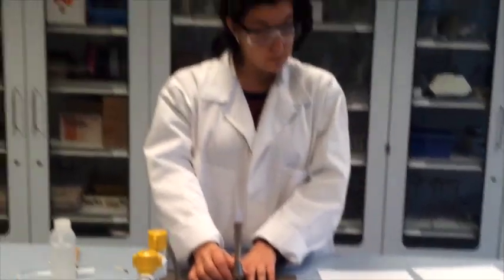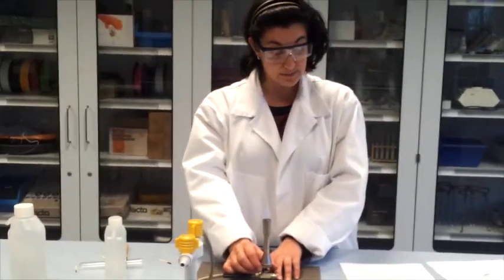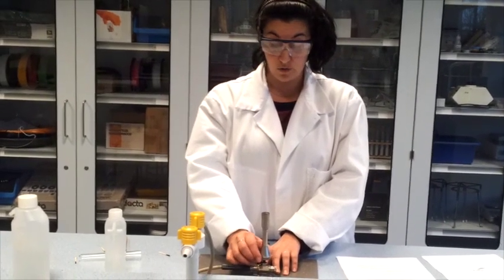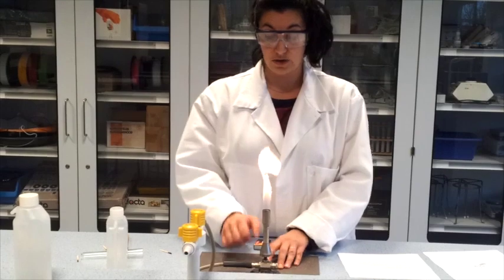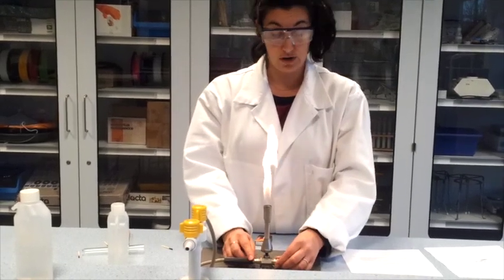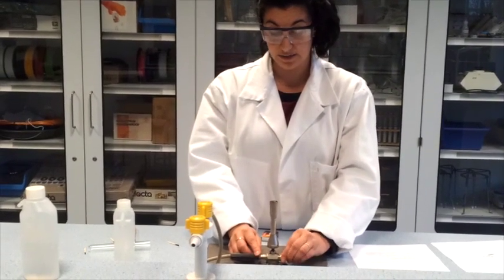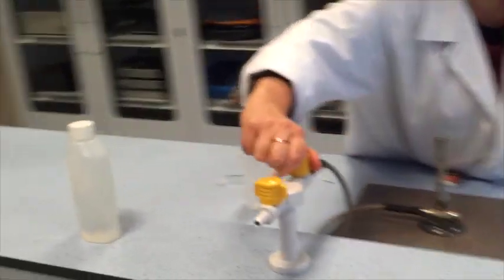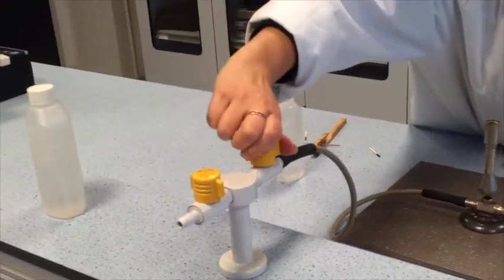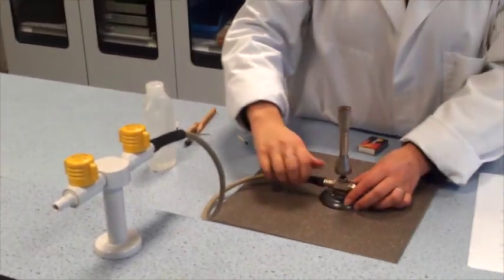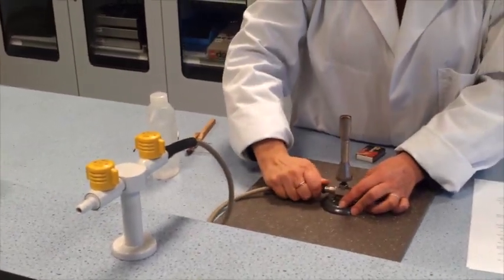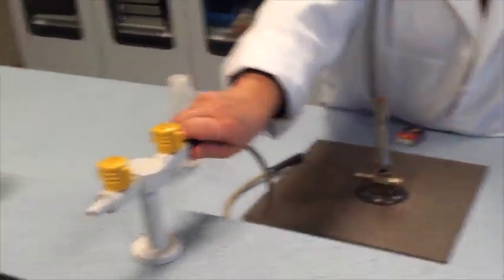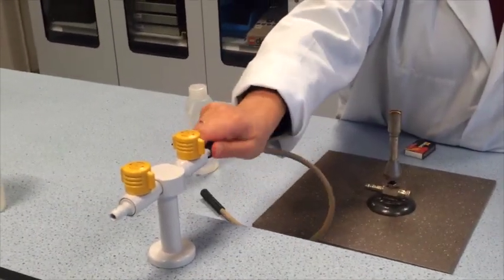To switch the burner off, go through the same steps in opposite order. We close the air hole. There is our safety flame again. Then we close the gas. We close the main tap by turning to the right, and we detach the rubber tubing from the burner in a turning motion and from the main valve.